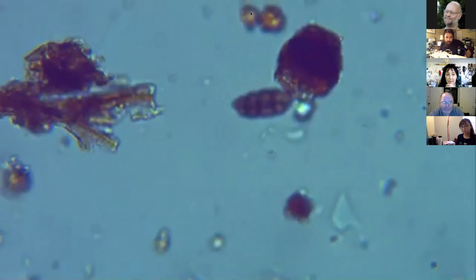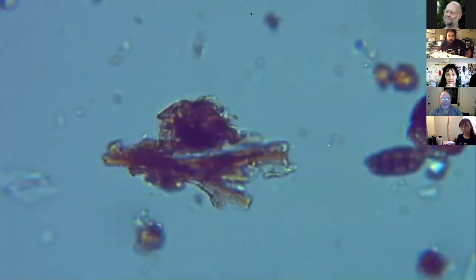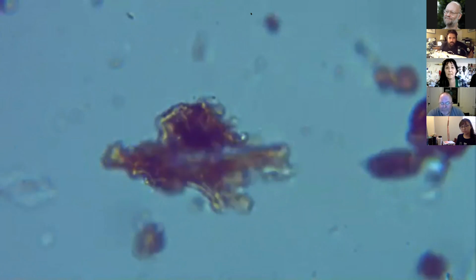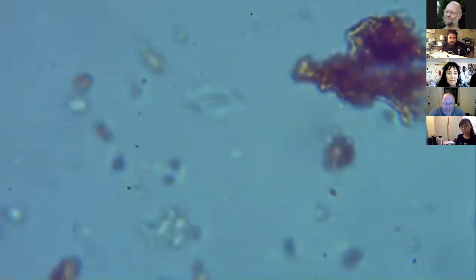All right, so right here we see a little bit of the plant matter. You see a little humate right there. Okay, so we see some humic clods, a humic substance. We got some bacteria that are floating around. You can see them kind of moving around there. Let's see here, but kind of a bust. So a little disappointing, but usually there's a bit more activity.